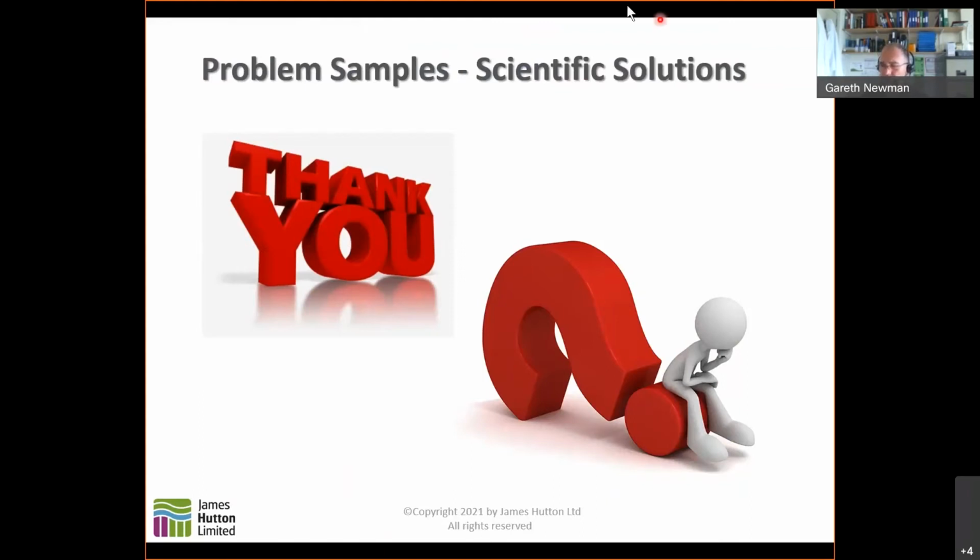Okay, so thank you very much for coming along to this webinar. I'll just run through some of the questions that we have and put back to the panelists. First question is to Steve on XRPD. How do you make a quantitative analysis by XRD, Steve?